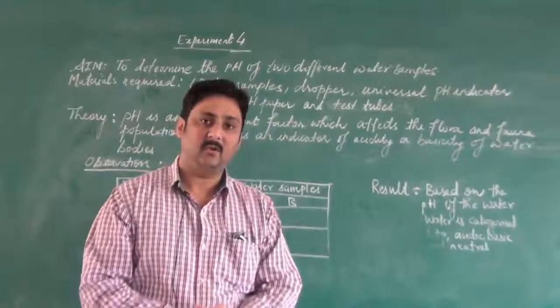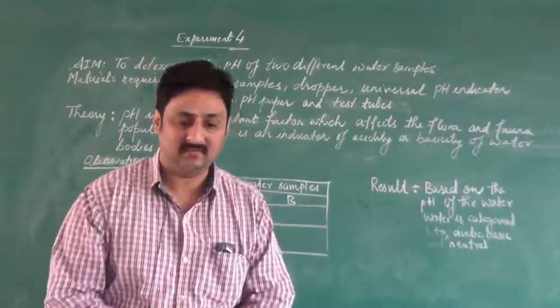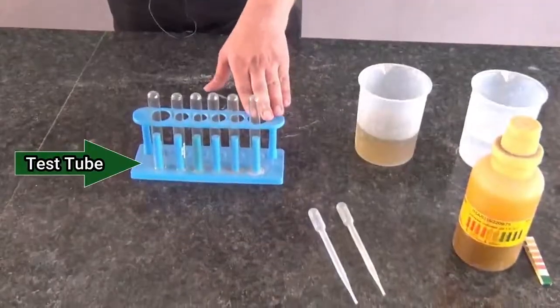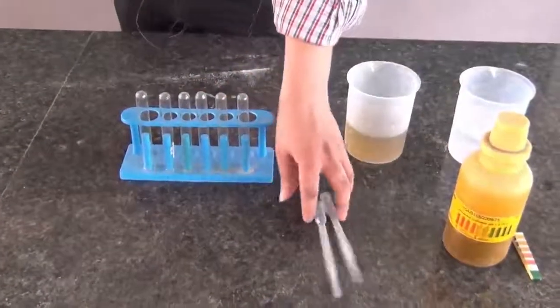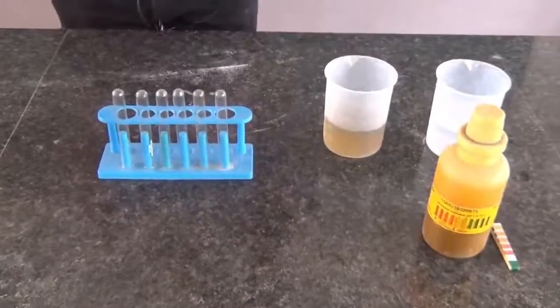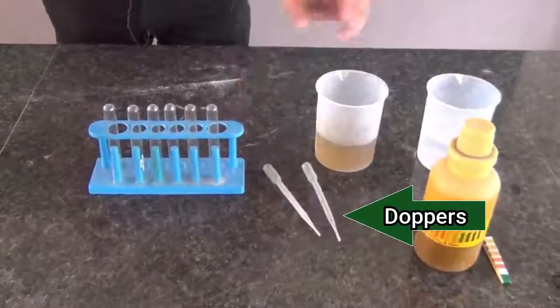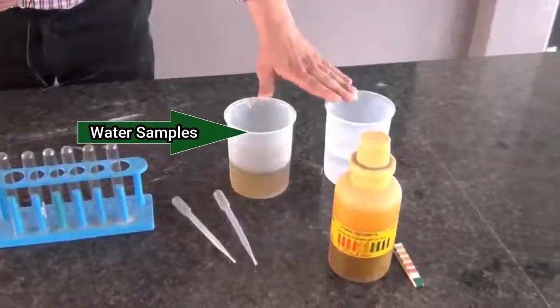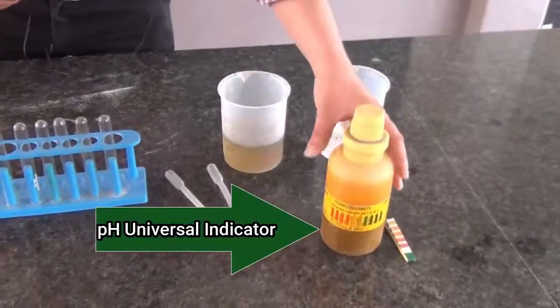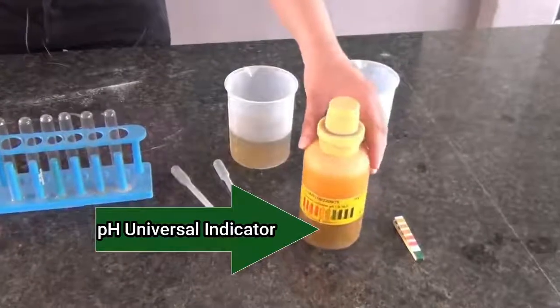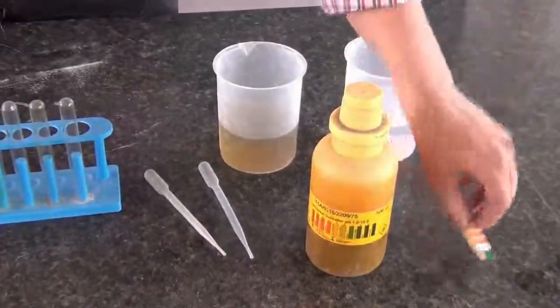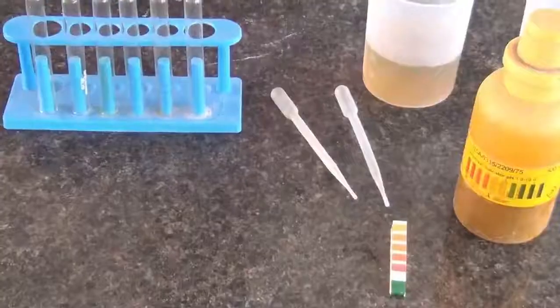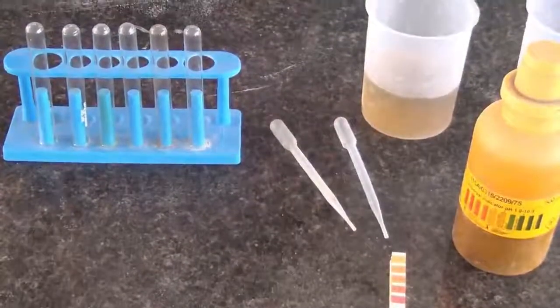Let us now talk about the apparatus here. You can see the test tubes which are being kept here. These are the droppers, two water samples one and two, this is a pH universal indicator solution, and we have the pH paper also. Now let us start with the experiment.